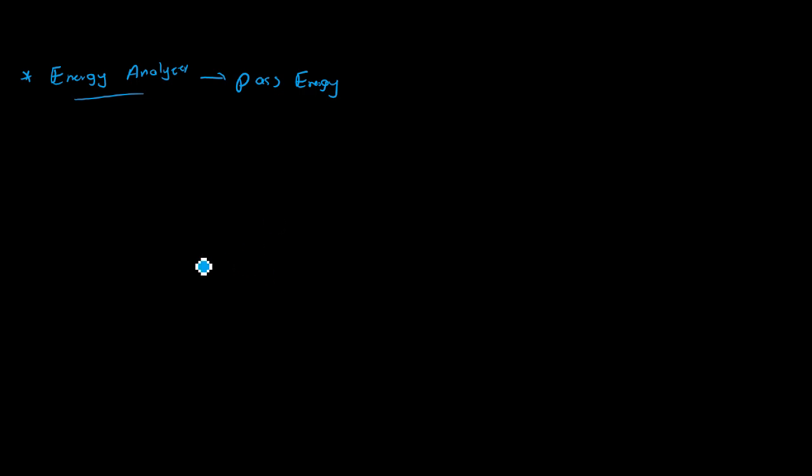We can make our window narrower. We can tell the instrument that we are only focused on this narrow energy gap. Then it will filter the electrons up to this narrower energy gap. So only the electrons with the specific energy, if inside this energy gap, will go through.